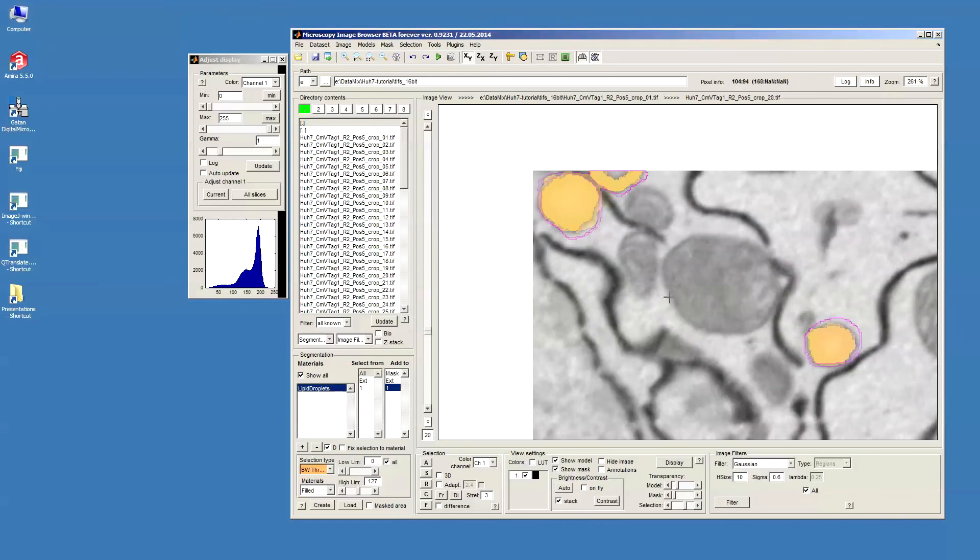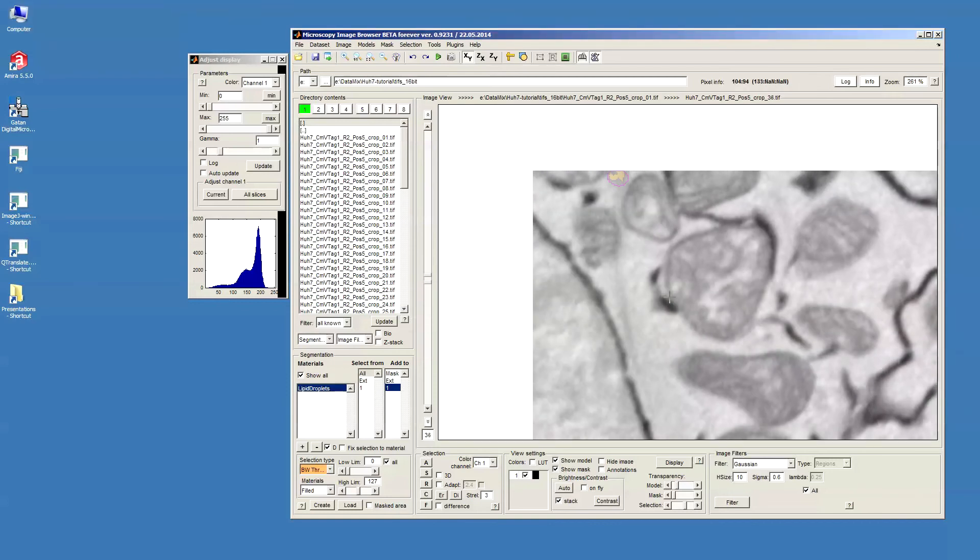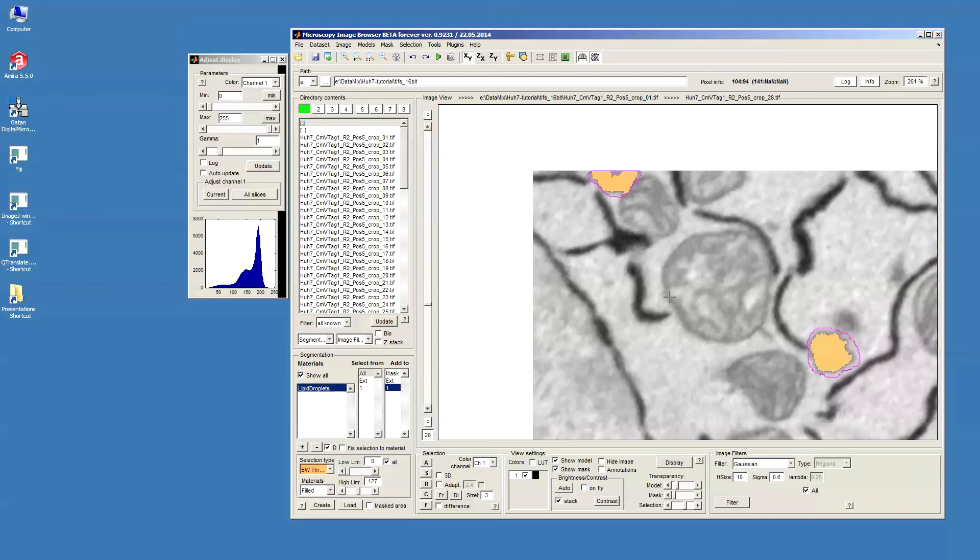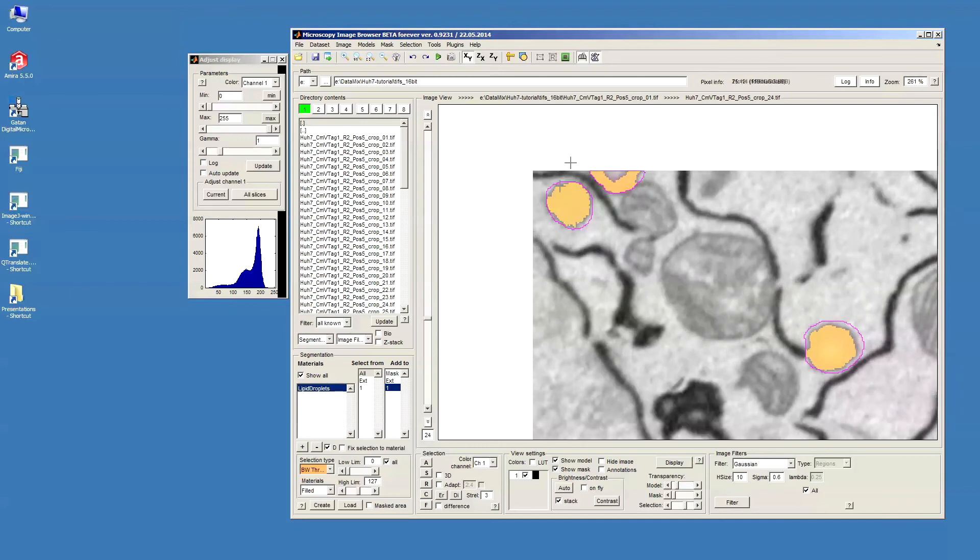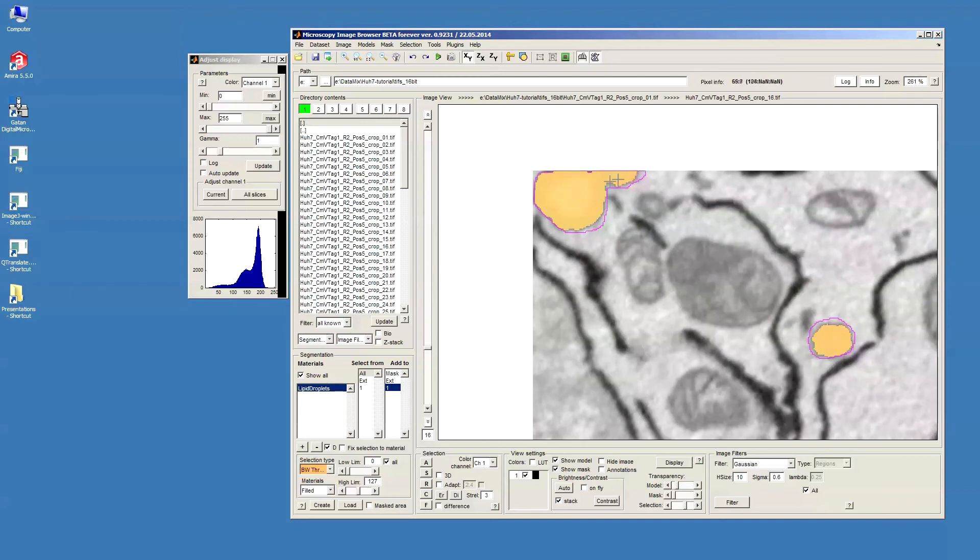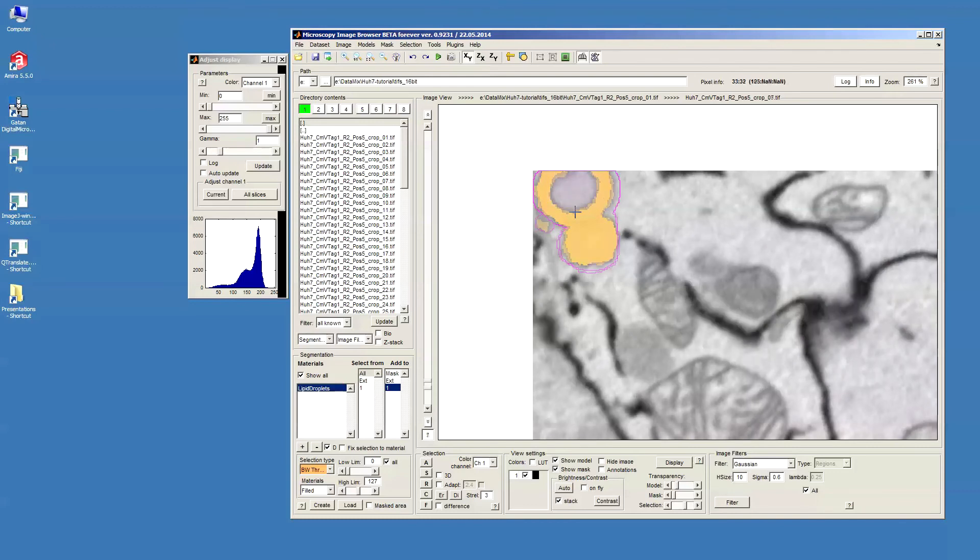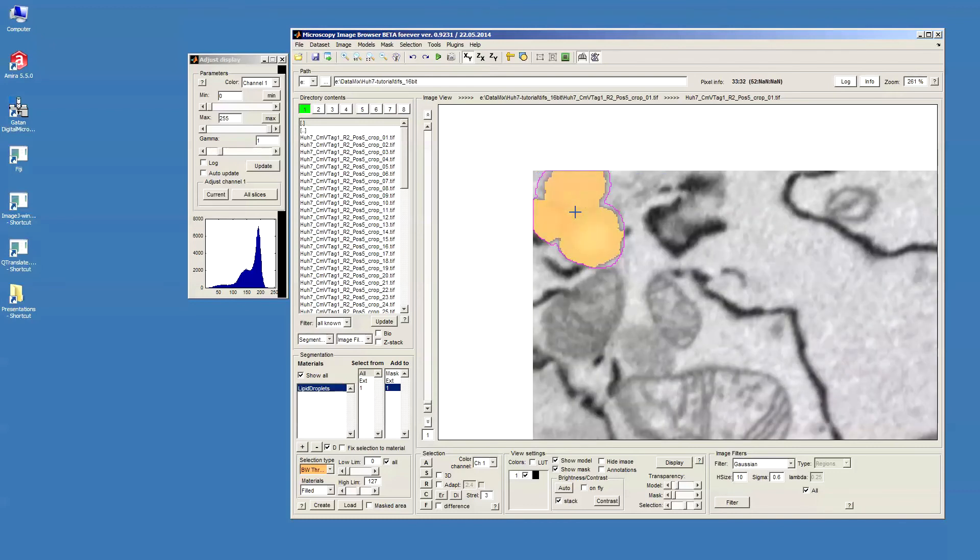Now you can see that I have segmented basically these lipid droplets. And those lipid droplets that have this kind of opening, we will actually be able to see inside of those.